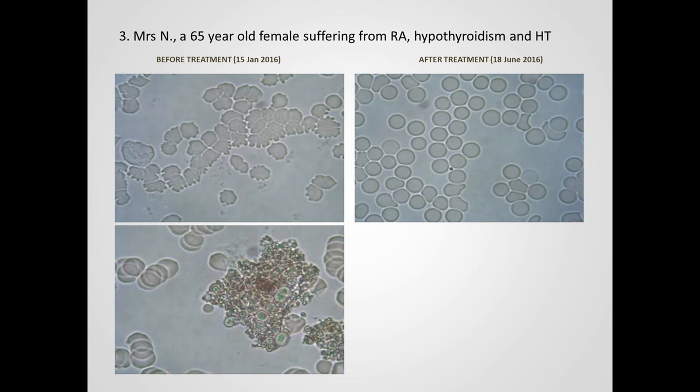Also, the very large obvious structure in this lower image on the left-hand side, greenish red in color, is actually a uric acid crystal. Now this we really often observe in practice with patients with long-term inflammatory conditions, and any type of arthritic condition.